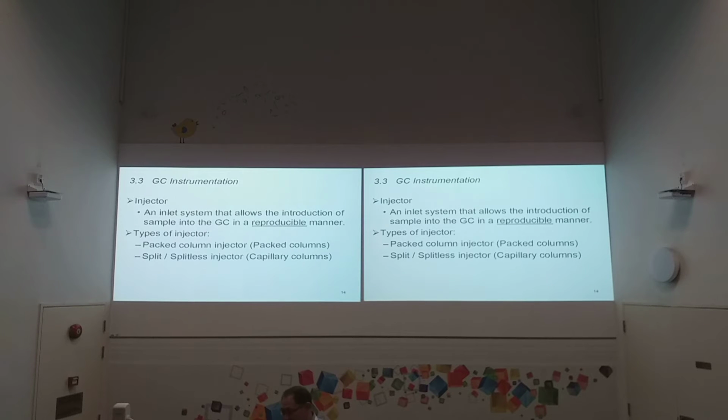So when we come to designing an injector, we also need to take this into consideration. Because in general, if you're an engineer, you design the device. So of course the consideration is why you do it. The device can help you to do things automatically, instead of just doing it 100% manually by our hands, right? So the important thing is, with the help of the device, you can introduce a sample in a very reproducible manner. But this device will also need to help you to vaporize the sample.